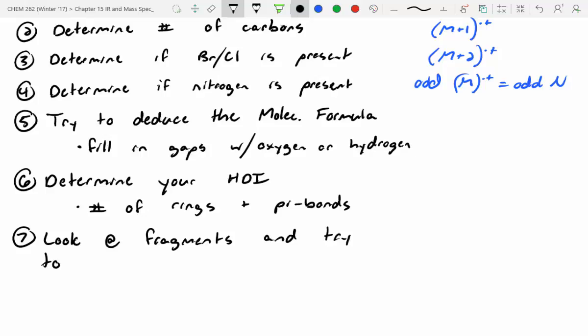And try to match with your appropriate isomer. So for example, on the pod that I gave you, you were able to come up with a bunch of constitutional isomers that fit your data. Then you can look at your fragmentation patterns and determine, hey, this fragment makes a lot of sense for this particular isomer that I came up with. So sometimes it's a pretty lengthy problem-solving procedure.